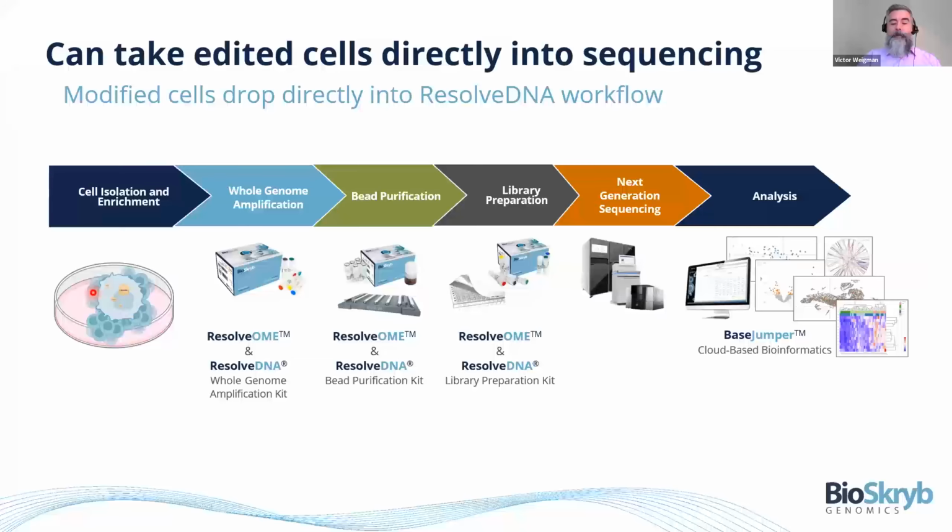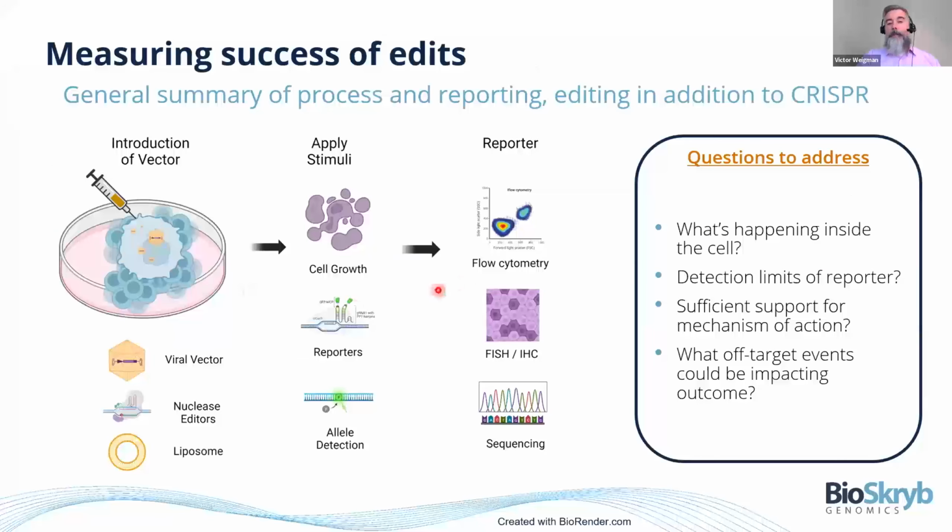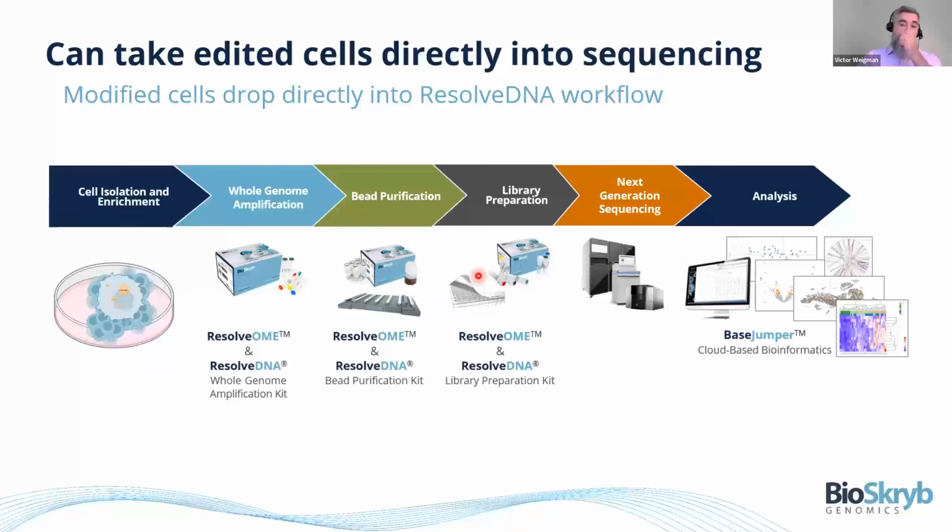So, starting from the very beginning of this process, you can go through your existing research experimental design, but you can also complement it by getting a deeper dive into the underpinnings of the genomes following these edits.